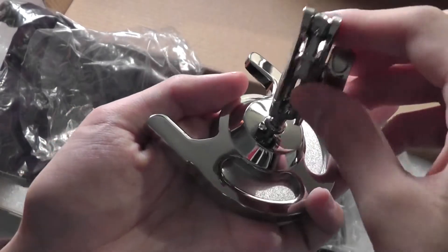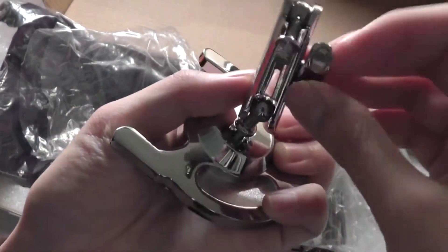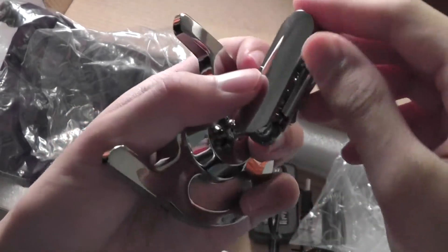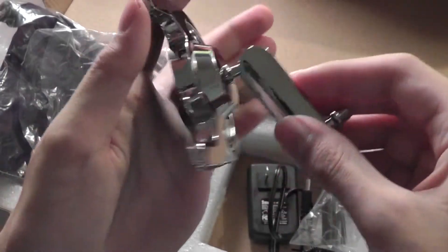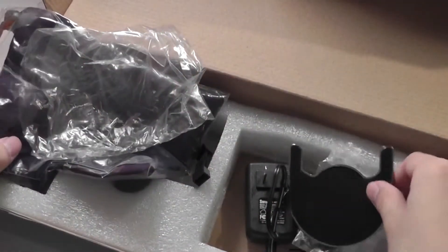It has a pivot hinge that you can adjust and navigate, so it allows you to rotate at 360 degrees and also up and down. A very adjustable and flexible stand is provided.